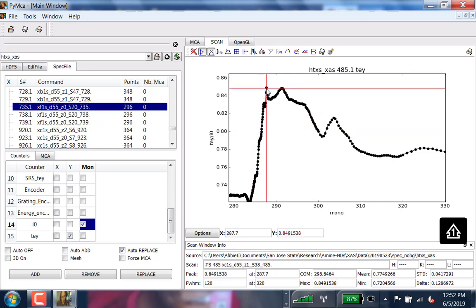Now on these experiments, we are off by 1.3 eV. And we'll use an X shift in Igor to correct for those errors. So that is not a big deal. Remember, the core hole exciton for diamond should be at 289.0 eV. We observe it at 287.7. The second absolute band gap in diamond should be at 302.0, and we're off a little bit as expected.